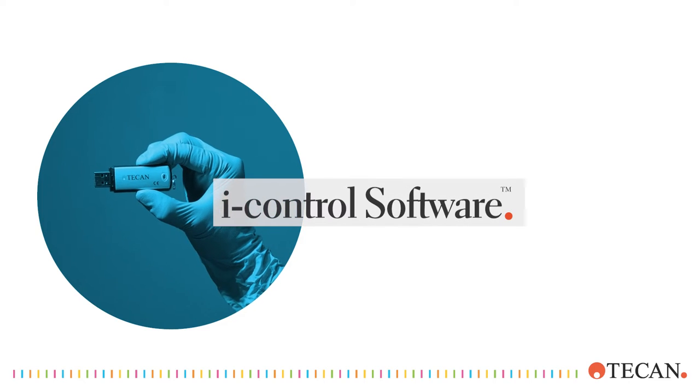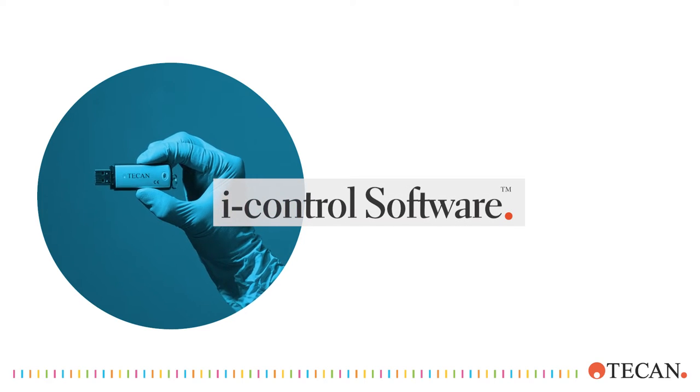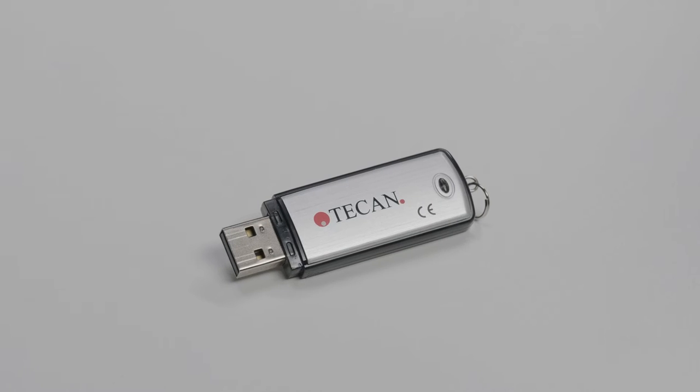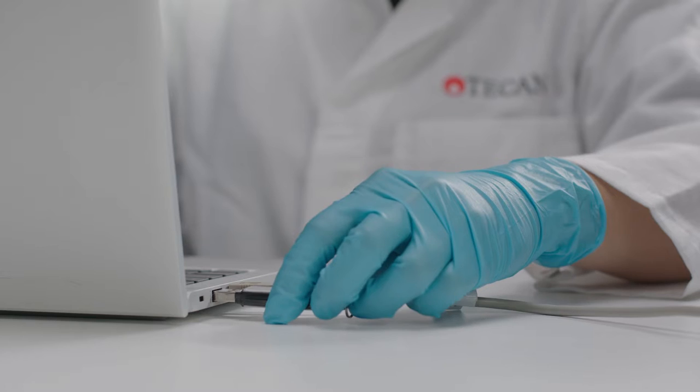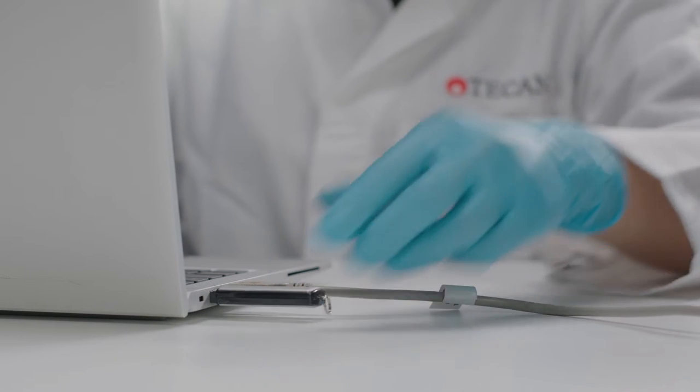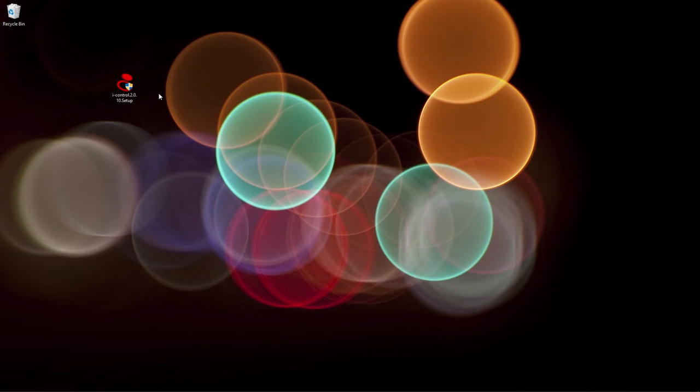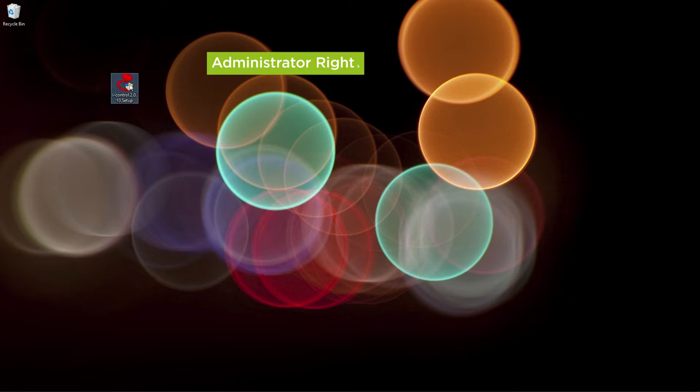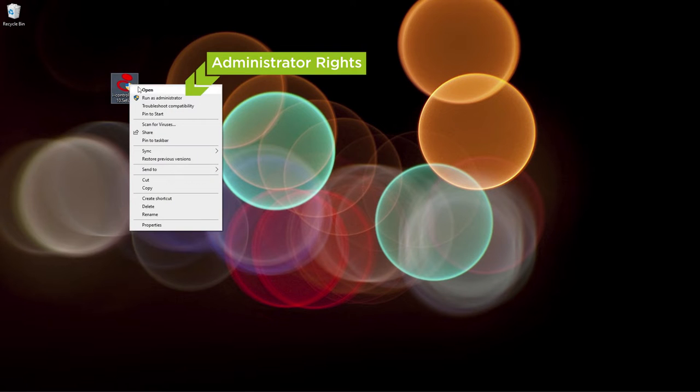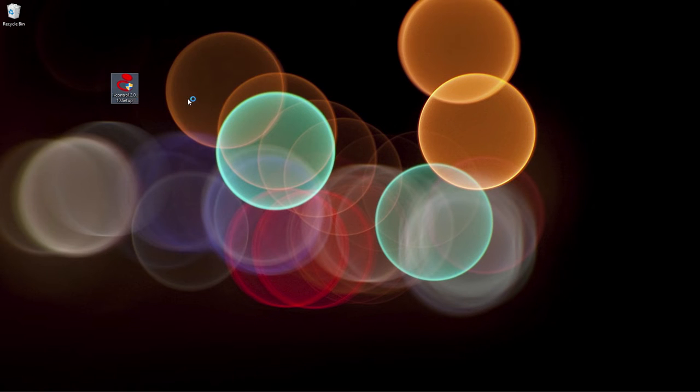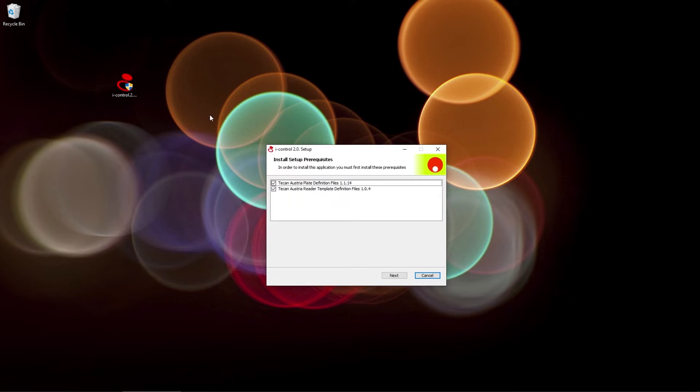Firstly, you'll need to install the iControl software. Start by plugging in the USB drive and transfer the setup file to your PC. Open the iControl setup file. Use an account with full administrator rights to install the software. Then follow the installation wizard instructions.